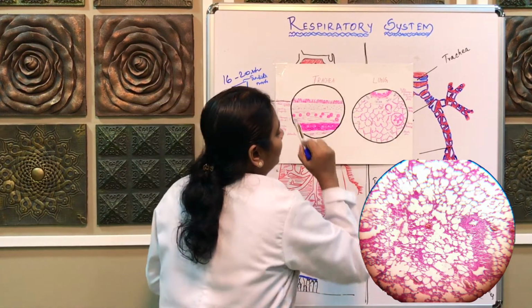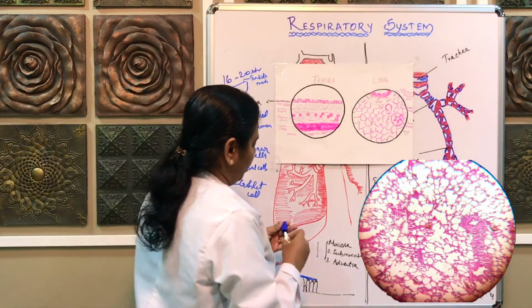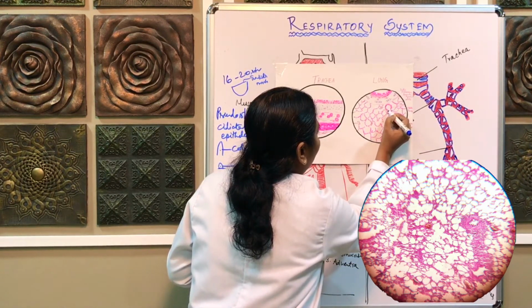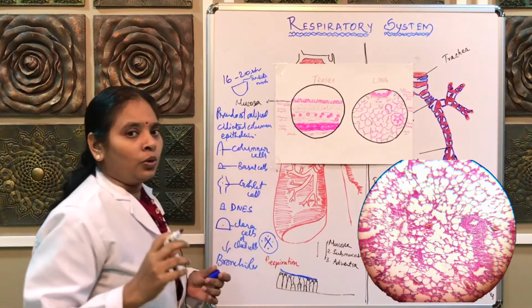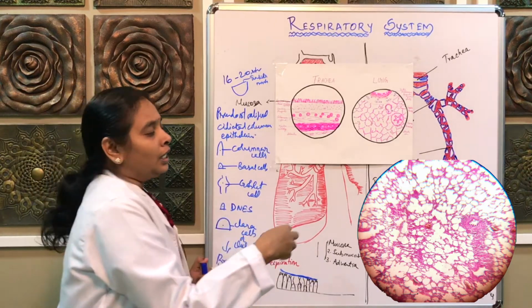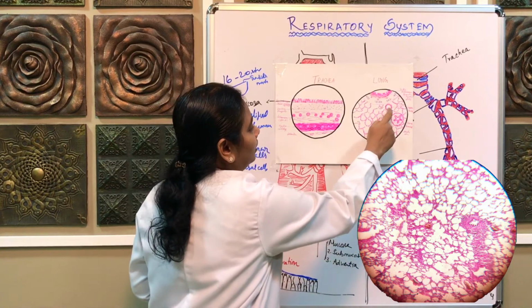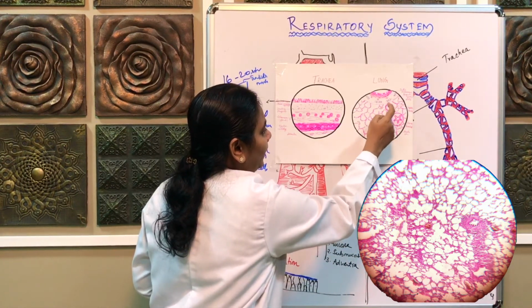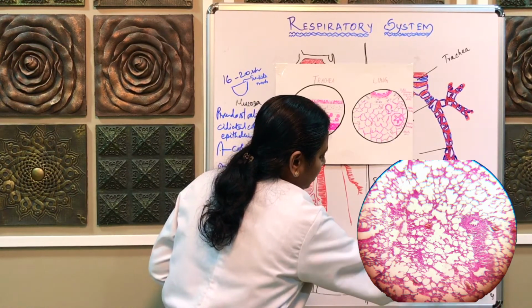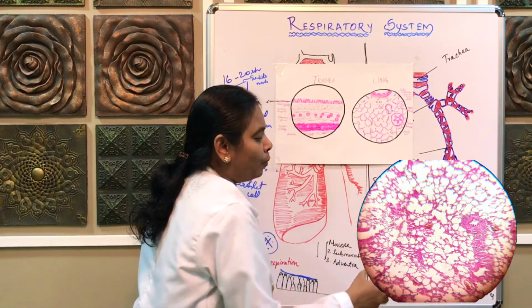Why is this bronchiole otherwise called the respiratory bronchiole? From the level of the respiratory bronchiole, see, there is an outpouching of the epithelium. This outpouching is like an alveolar sac, so it acts in respiration. So the gas exchange level has started. That's why the respiratory bronchiole is now called the respiratory pathway. The respiratory bronchiole is going to form the alveolar duct. Now the alveolar duct is going to branch into many branches. So each alveolar duct is now going to form each lobule of the lung.